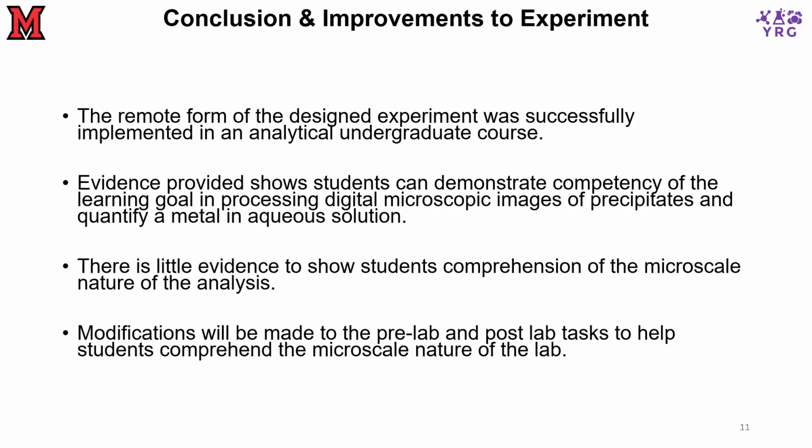In conclusion, the remote form of the design experiment was successfully implemented in an analytical undergraduate course. Evidence provided shows students can demonstrate competence of the learning goal in processing digital microscopic images of precipitates and quantify a metal in aqueous solution. There is little evidence, however, to show students' comprehension of the microscale nature of the analysis.